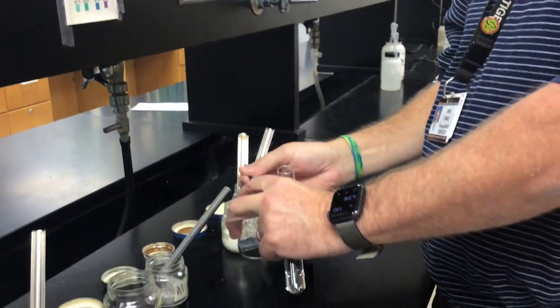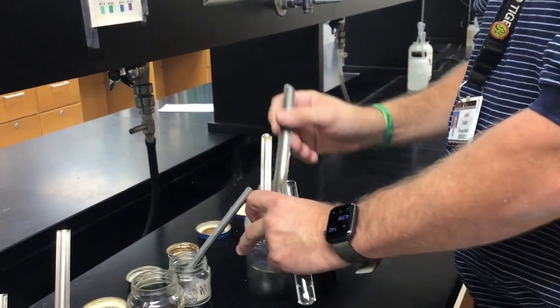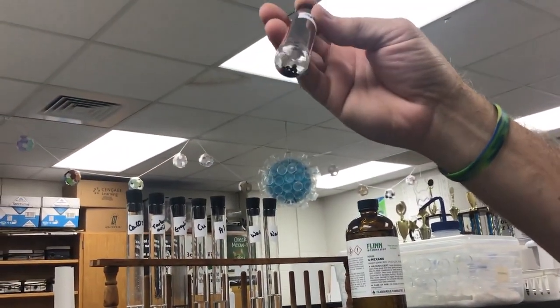Come on, lead. Oh, these little lead pellets like to run off the scoop. There we go. So there's lead. You can see those pellets kind of sitting down there in the bottom.